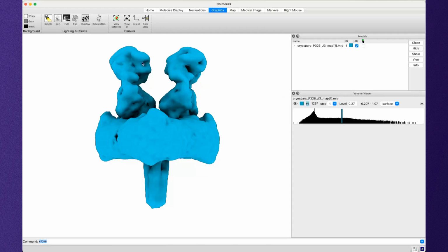And we know that these fabs want to move apart from each other. And so the tetrahedra that are connecting these fabs, which may not be very many, it may only be 2 or 3 tetrahedra between the top lobes of these two fabs, will have to stretch and compress as those fabs move away from each other and toward each other. And that is expensive in terms of the model, right? The model is trying to reduce how much stretching it does because we don't expect there to be these really, really large fluid motions. But here, there shouldn't be any penalty on really stretching this space apart because there's nothing in there to stretch, right? We know that that's just solvent in there, but the 3D flexible refinement model doesn't know that.